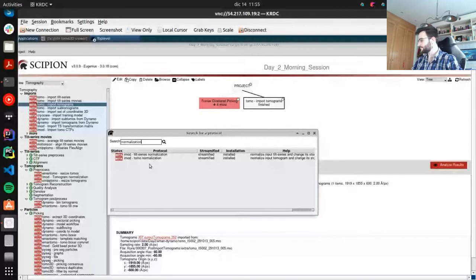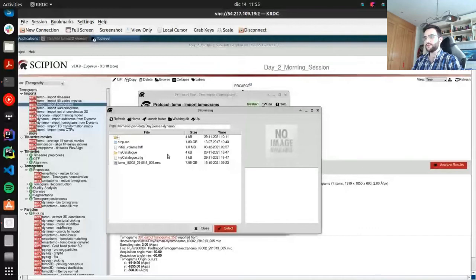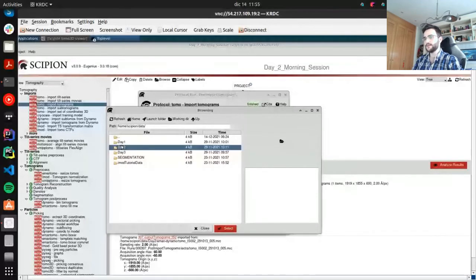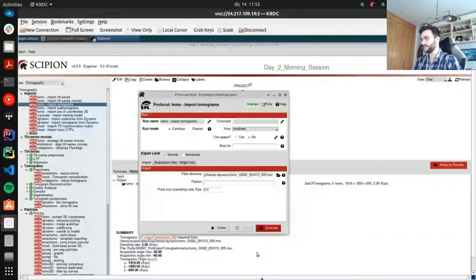David: Yeah. Sorry, could you repeat which file you have selected? Yeah, sorry. I will repeat it. You need to go to your home, then data, Day2, Eman Dynamo, and it is this one here, Tomo IS002 and so on, .mrc. Okay, just click it once to avoid opening it and select it. Okay, you should have it there.